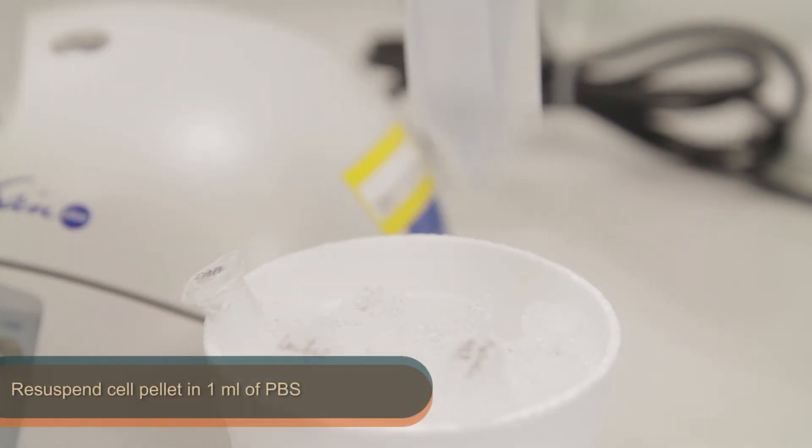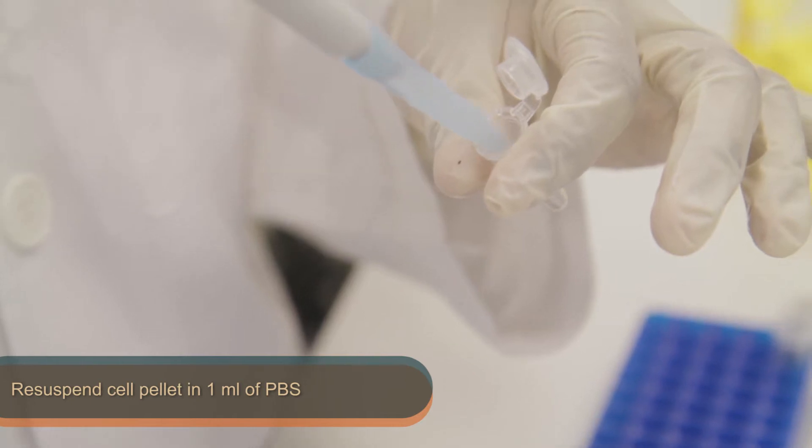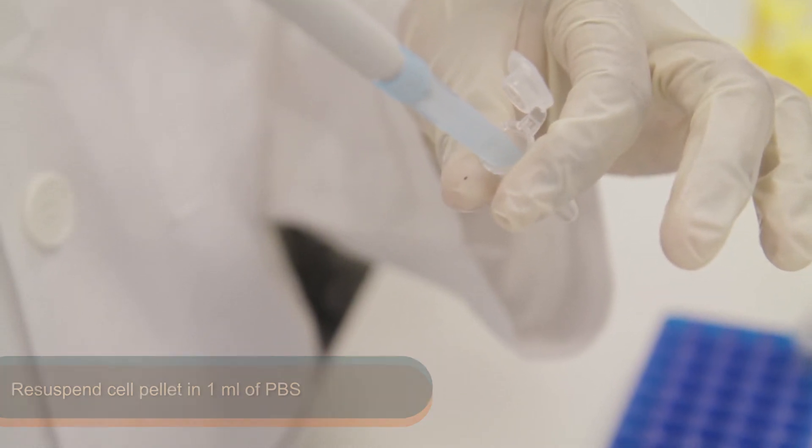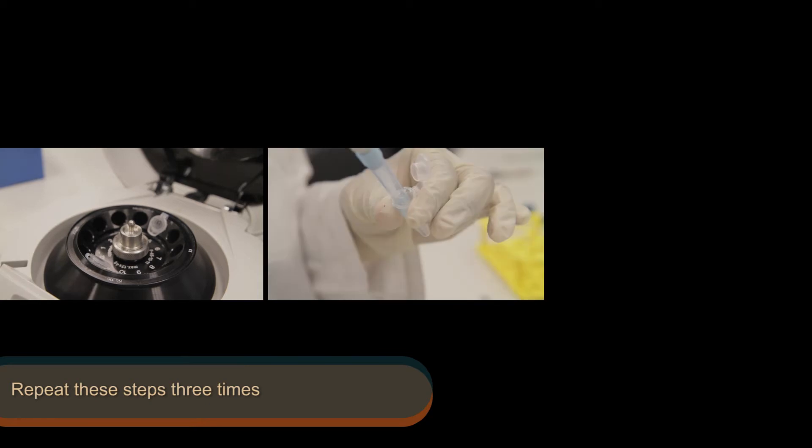Next, re-suspend the cell pellet in 1 ml of PBS. Repeat these steps 3 times.